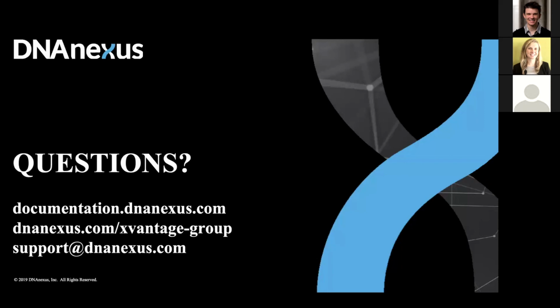Just a quick note to that. If you do not find an app that you would like to run on DNAnexus, please reach out to support@dnanexus.com as listed on the webinar, and we'd be happy to provide that app into your project as well. So we have a larger app library, which is private, which we maintain ourselves. So I would highly recommend you to reach out to us directly if you do not find a specific application that you're looking for.